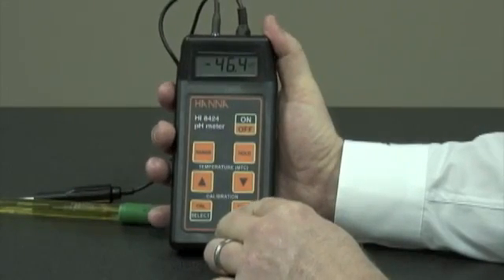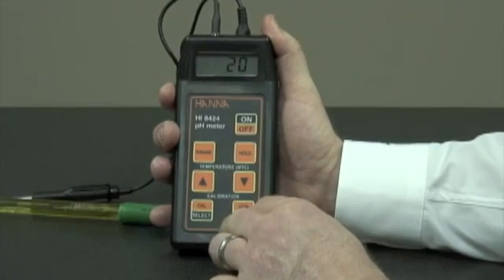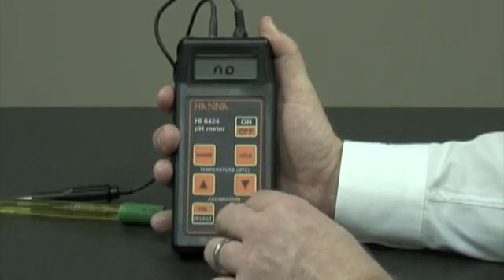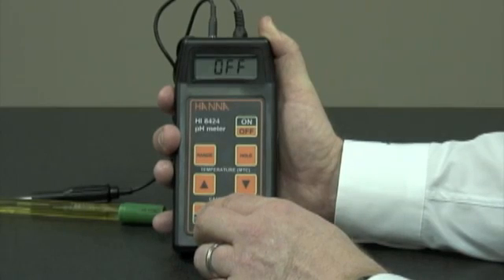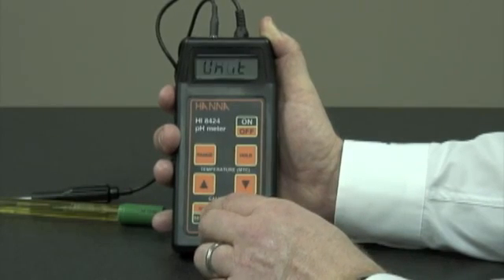The setup button — if you hold it down for three seconds, you can use some of the features. You have the auto-off feature; you can time it so that in 20 minutes the unit will prompt you to shut off or not. You can also turn the beeps on or off, and you can switch manually from Celsius to Fahrenheit.